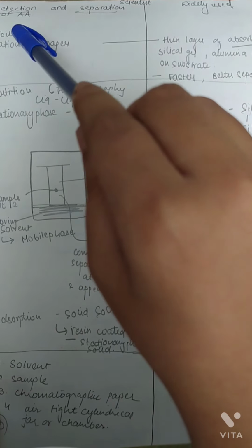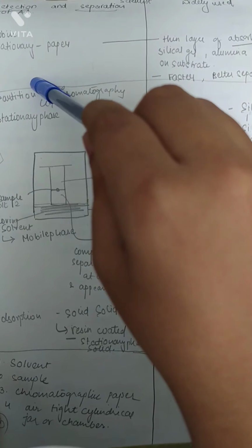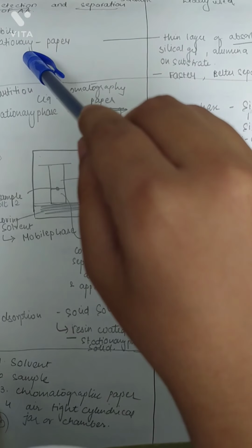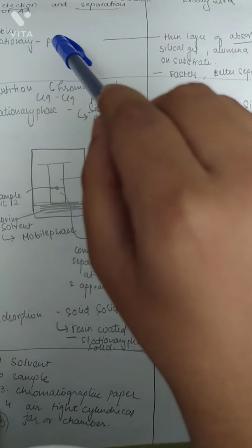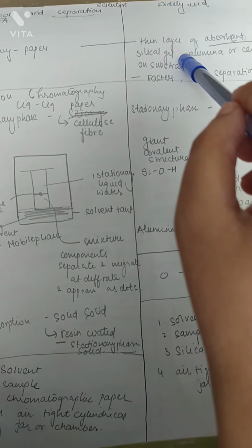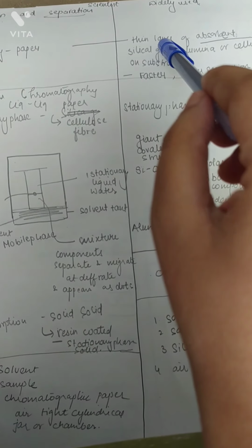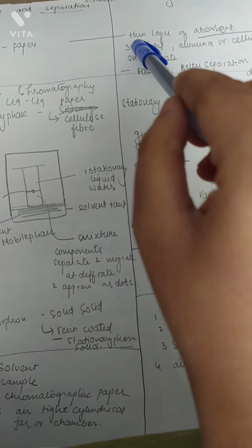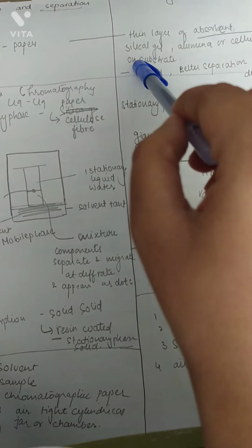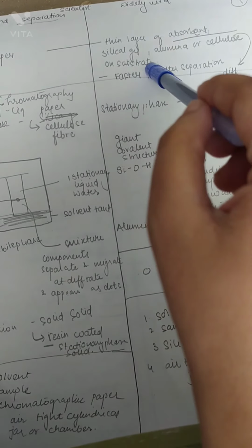एक चीज आपको इन दोनों में सबसे पहले याद रखनी है that the mobile phase and stationary phase, there are two phases. In paper chromatography, the stationary phase is paper, and in thin layer chromatography, the stationary phase changes and it would be a thin layer of absorbent, that is mainly silica gel, alumina or cellulose on the substrate.